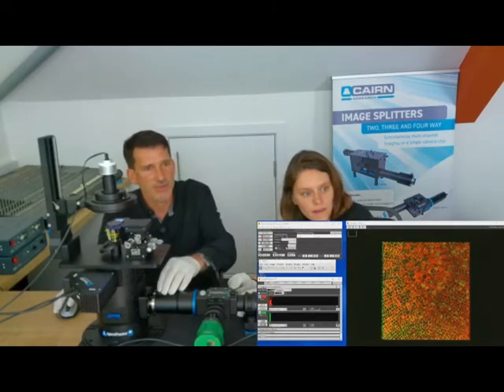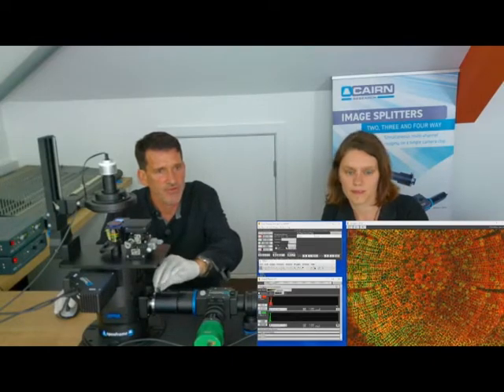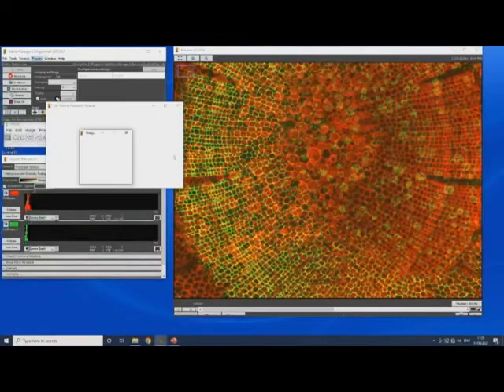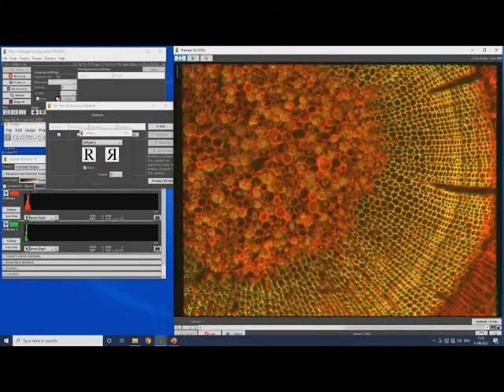Okay, I think we can open that up. So we then open up the aperture to just overfill the camera chip, which reduces any potential background or light bouncing off area peripheral to the chip. You might still be thinking, hang on a minute, that's not very well overlaid. That's just because when you start it up, one of the cameras will be flipped relative to the other. But there's a helpful tool in the micromanager software that Jez is just going to show.